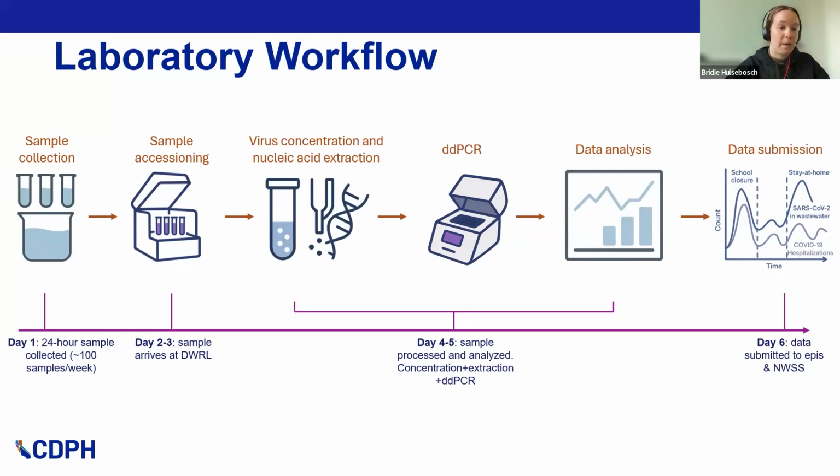But during this time, we also monitor any of the conditions at arrival. So ideally, the sample is below 10 degrees Celsius, and things are not spilled out. And if there is anything unusual about the sample we observe, we do have norms we see with samples on arrival. Like we'll receive some samples from some utilities that usually have a lot more debris and others that have less debris. And we have sometimes received samples in weird conditions, like this sample is slightly pink. This is where we will record all of that information and get it ready for our workflow.